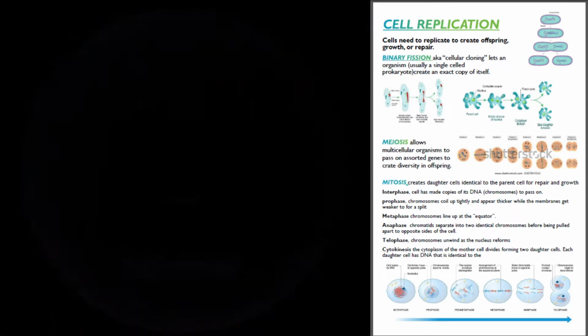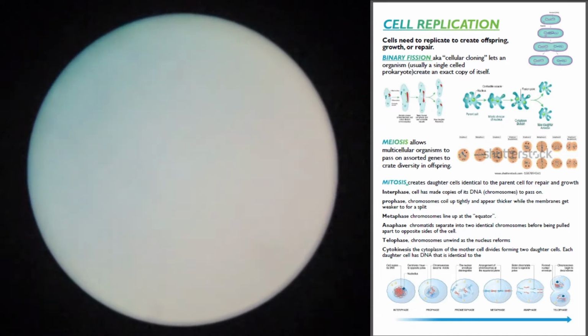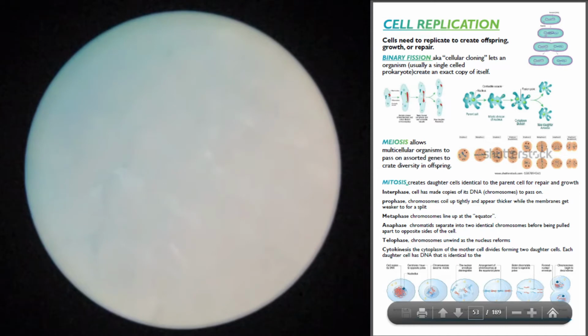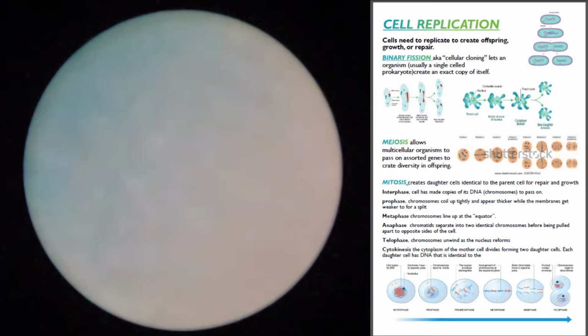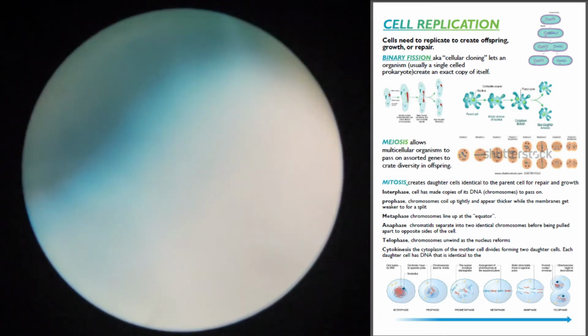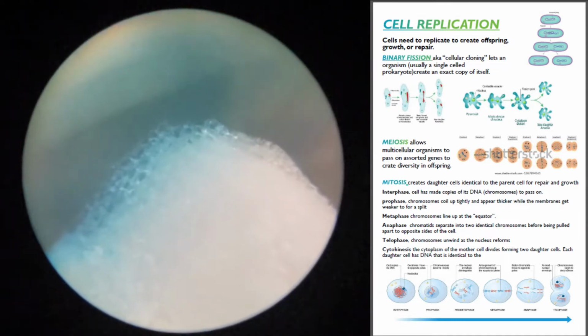I'm going to go to the yellow 10x, so 100 times magnification total. Easing around, easing around. I think my autofocus on my phone might be losing it for me. So one more shot. I go back to scanning. Find it. Wrong way. There it is. I'm going to move it down.